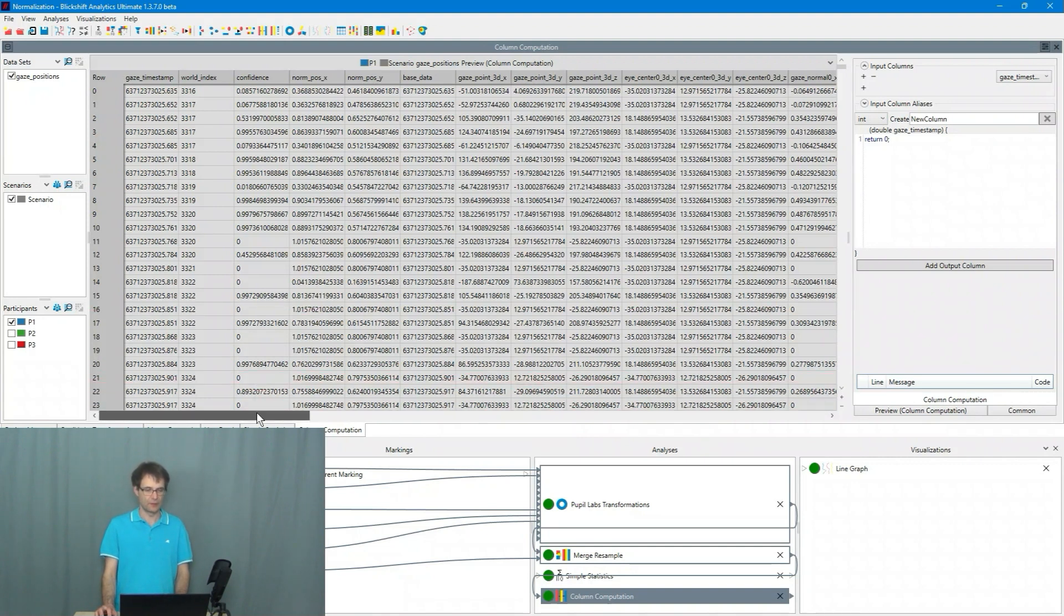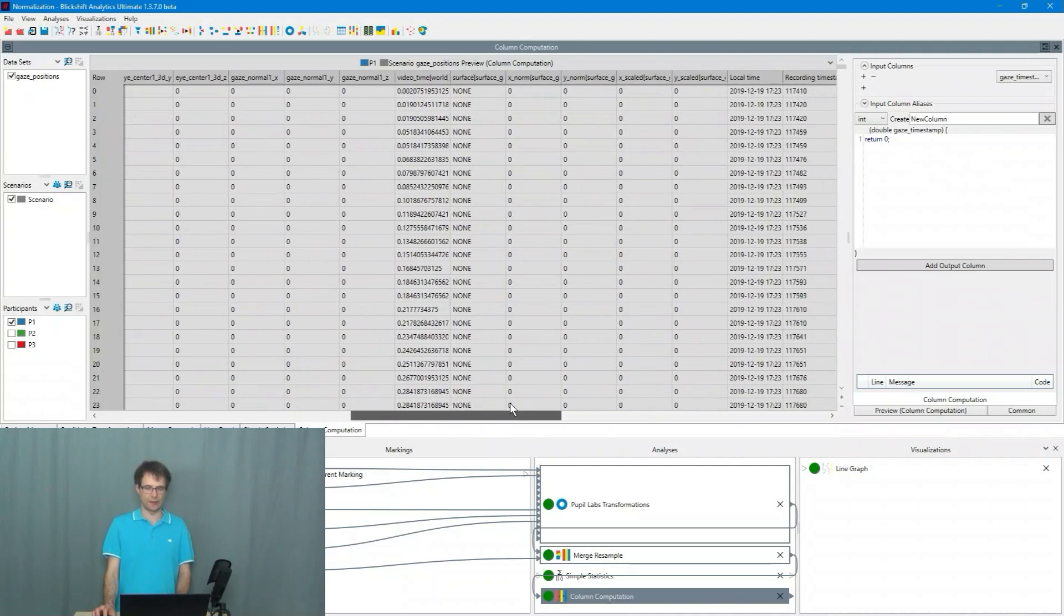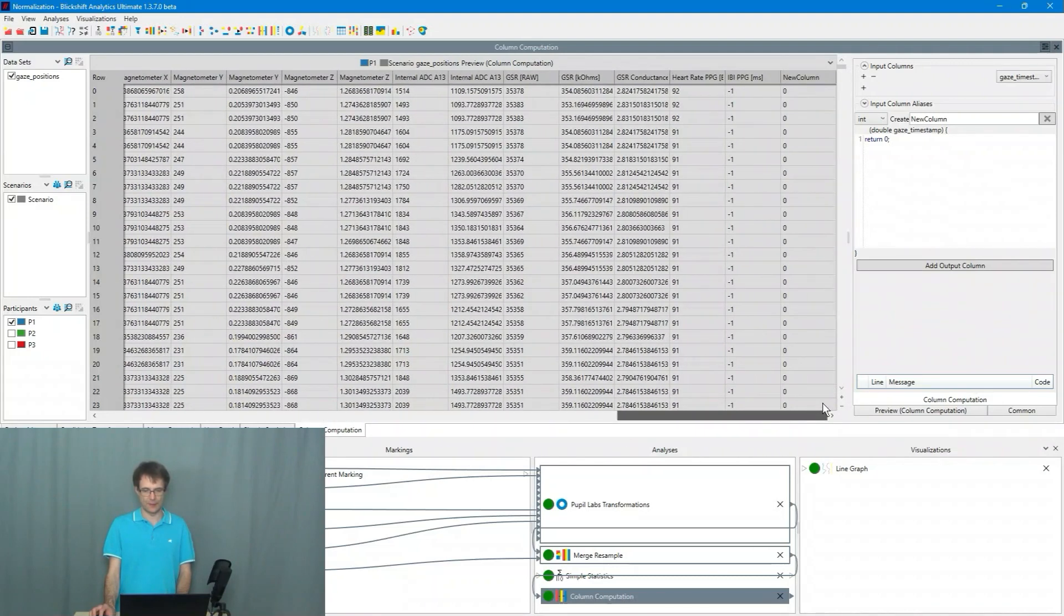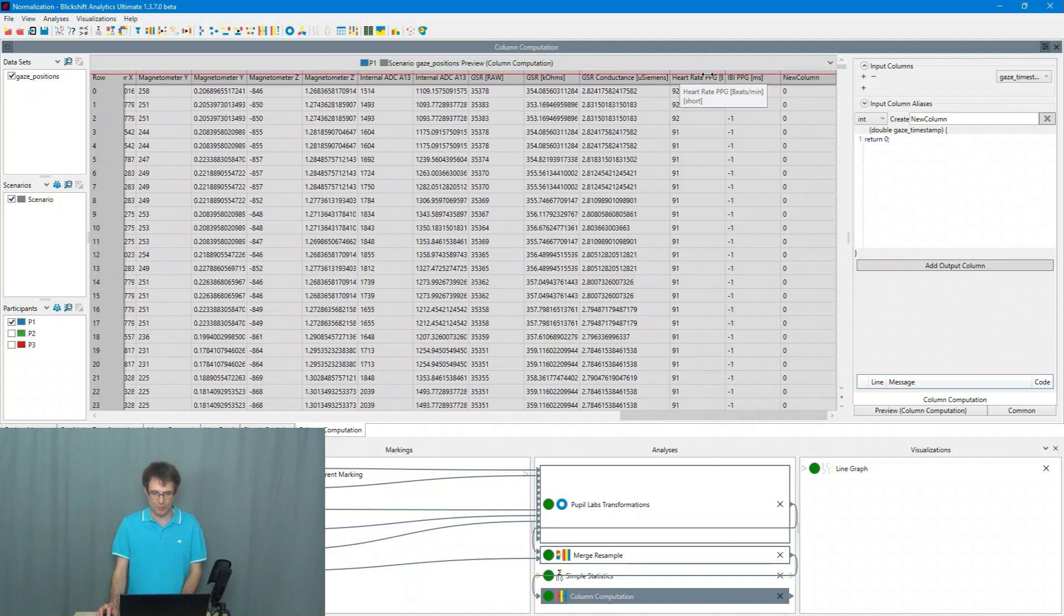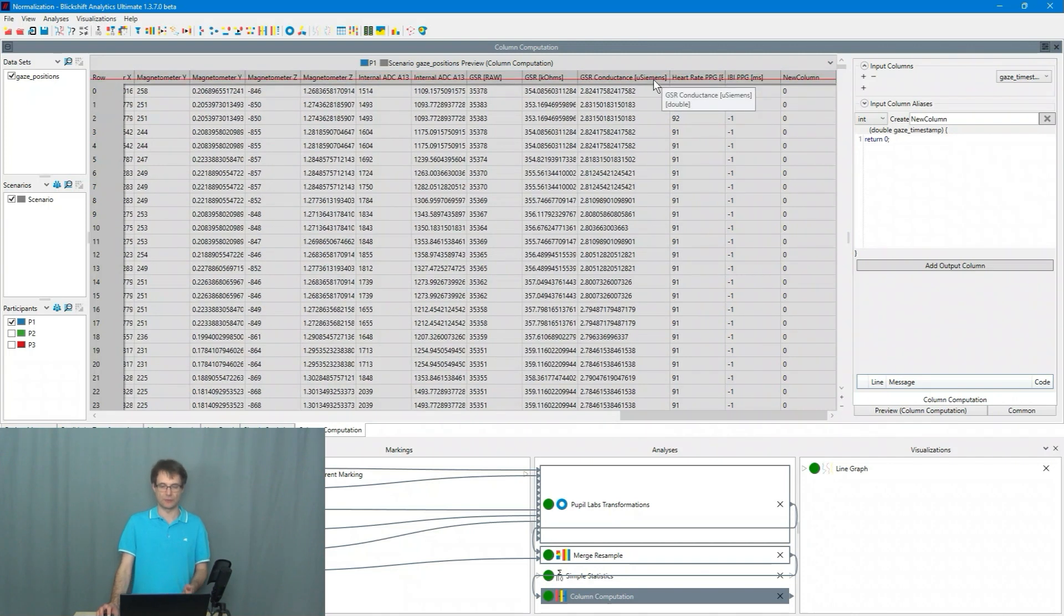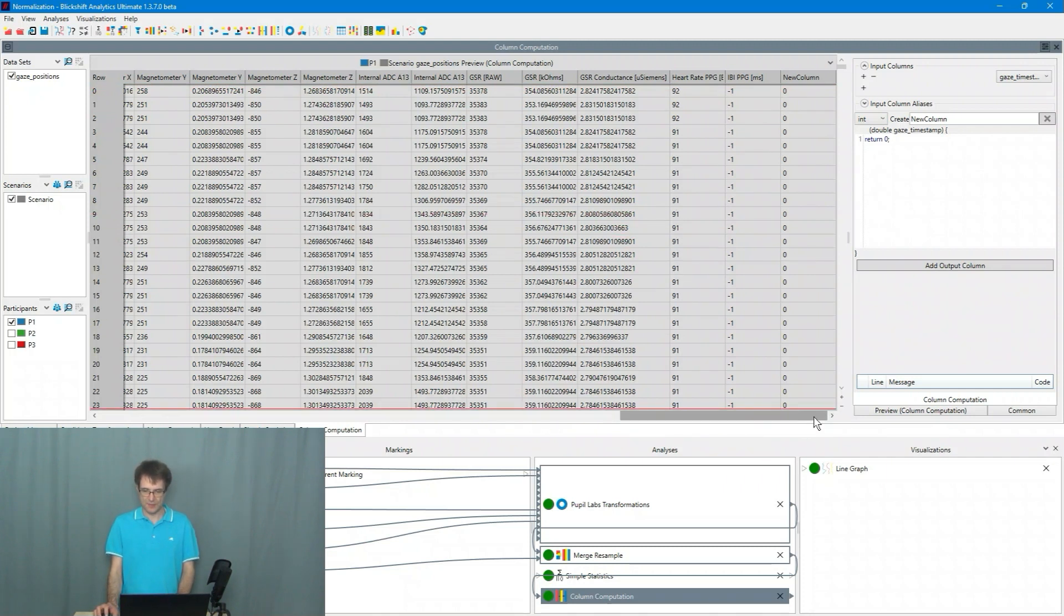Here we can see the whole data of P1. And what we want to do is we want to normalize the GSR conductance in micro Siemens this column here. So I go to the column computation.